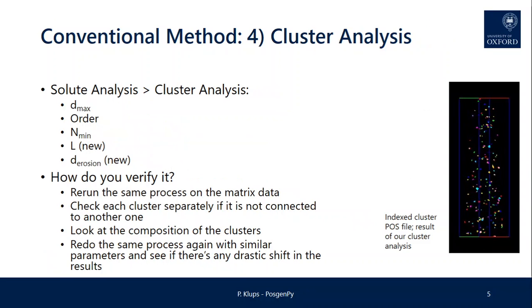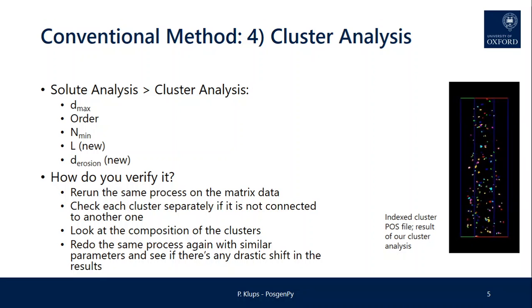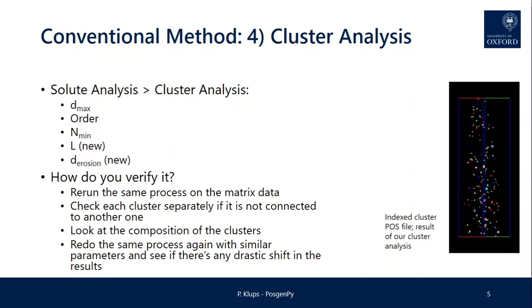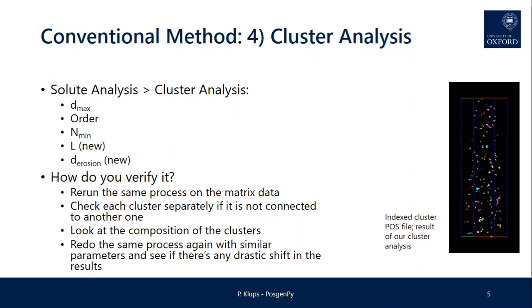Finally, we can use our selected parameters to run the maximum separation cluster analyses, and there are two new ones that we haven't checked previously. N, L, and the erosion, which you can't really pre-verify, just like we did with Dmax and n-min.